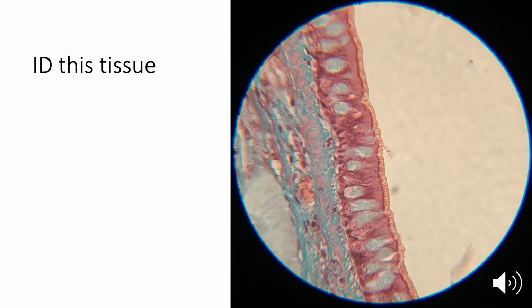Here's a pretty colorful tissue. This is one of the slides that we have for this particular tissue type, and it should look somewhat similar to the last slide in terms of the features we see. Big empty space here. We have that apical surface, so it's an epithelium. I also see cilia and a columnar shape here. So this is columnar epithelium.